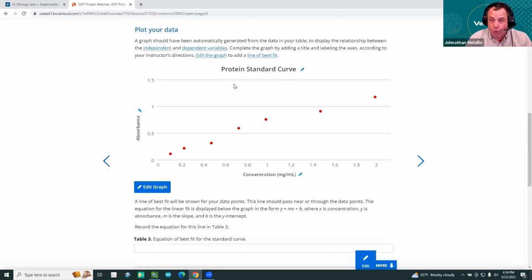And that brings up a good point, is that I really never knew what Beer's law was. I'd heard Beer's law before. To me as a biologist, I just knew what standard curves were. So you created a standard curve. Beer's law just refers to, with the spectrometer, if you're creating a standard curve with known standards, the absorbance is going to change linearly or proportionally using a spectrometer. So they're kind of interchangeable in this case. Beer's law is very specific, but we've created a standard curve.